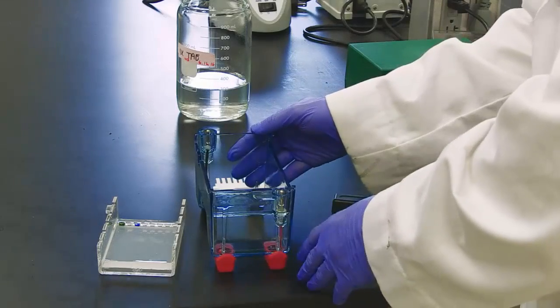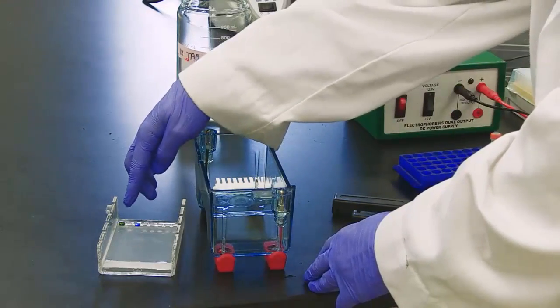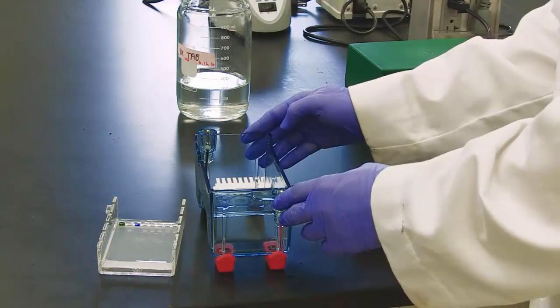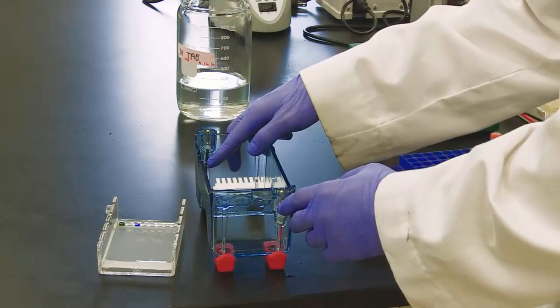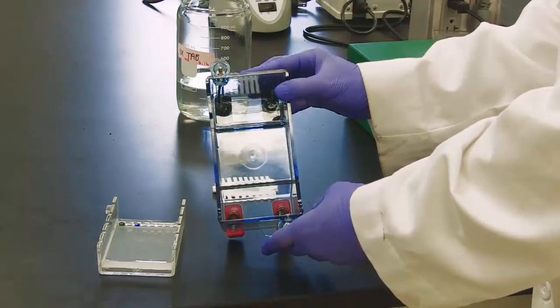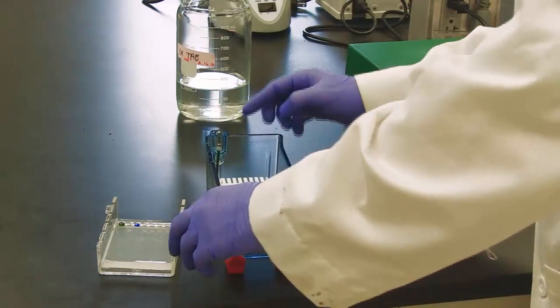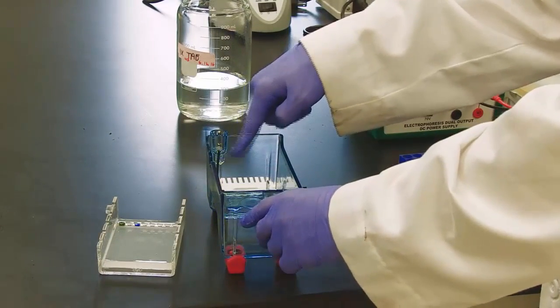Because DNA is negatively charged, I need to have the top of the gel, where my wells are, be at the negative end. And so if we look at this gel box, you'll see the black wire and, if I tilt it, also the red wire. So when I put my gel in, I'm going to put my gel in such that the wells are at the negative end, where the black wire is.